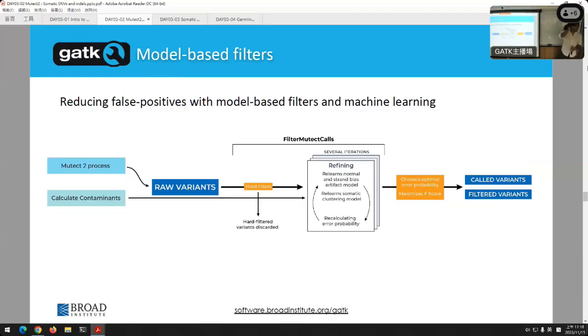And then, as is the case for optimization problems, we do some tweaking. We say, well, what if we change our threshold a little here in filtering? What if that was an error or not? And we say, does that bring the likelihood up for the whole call set?